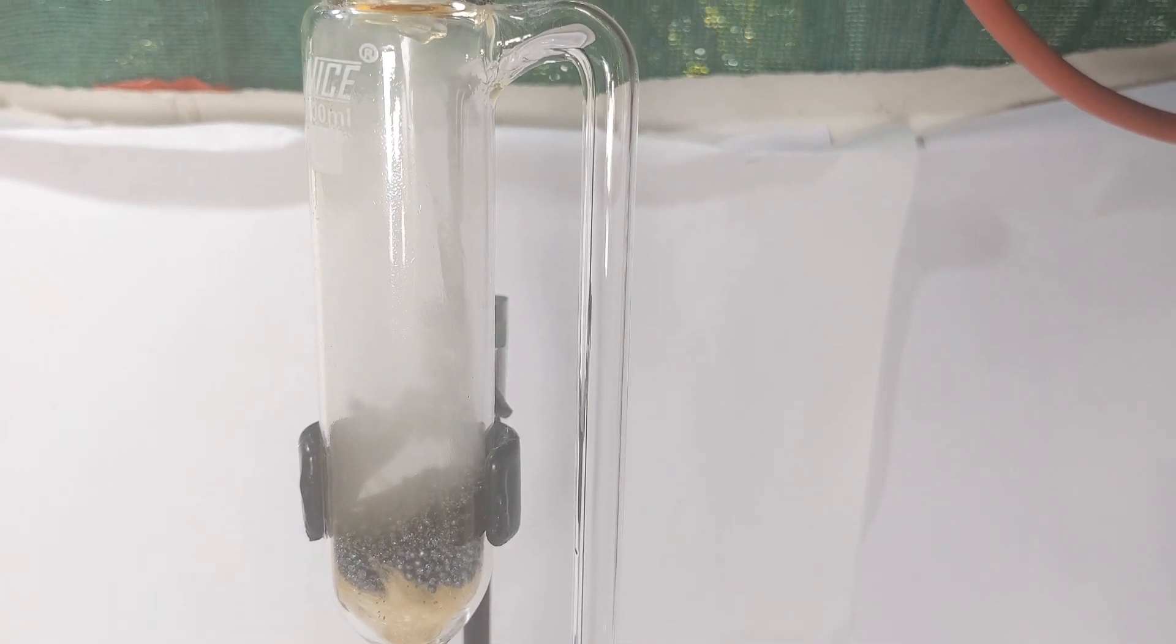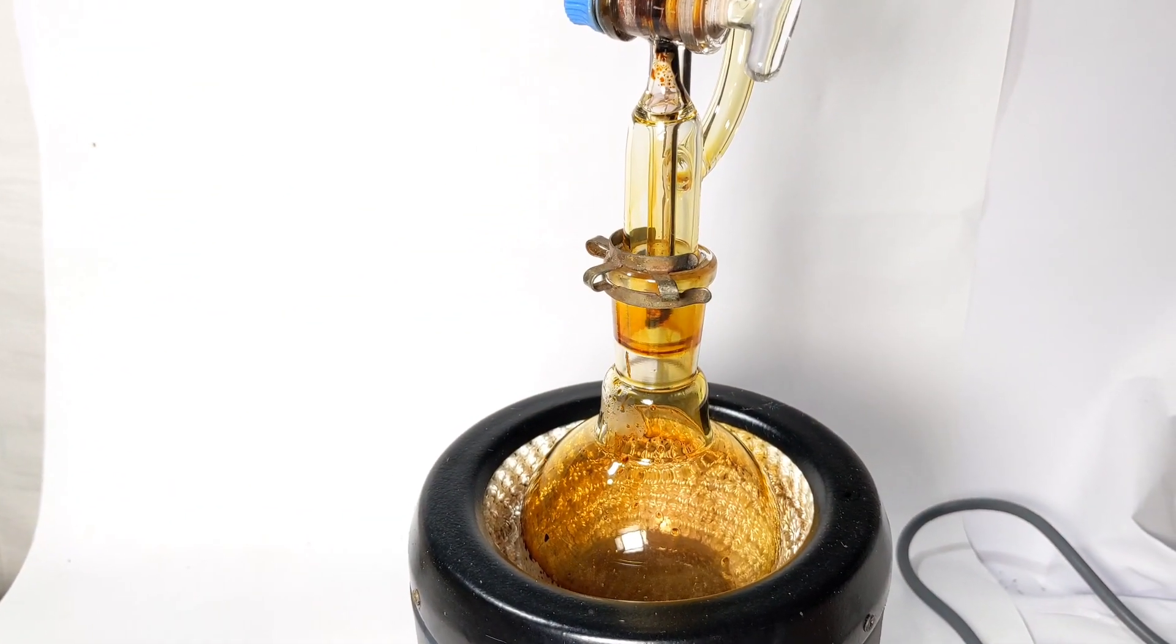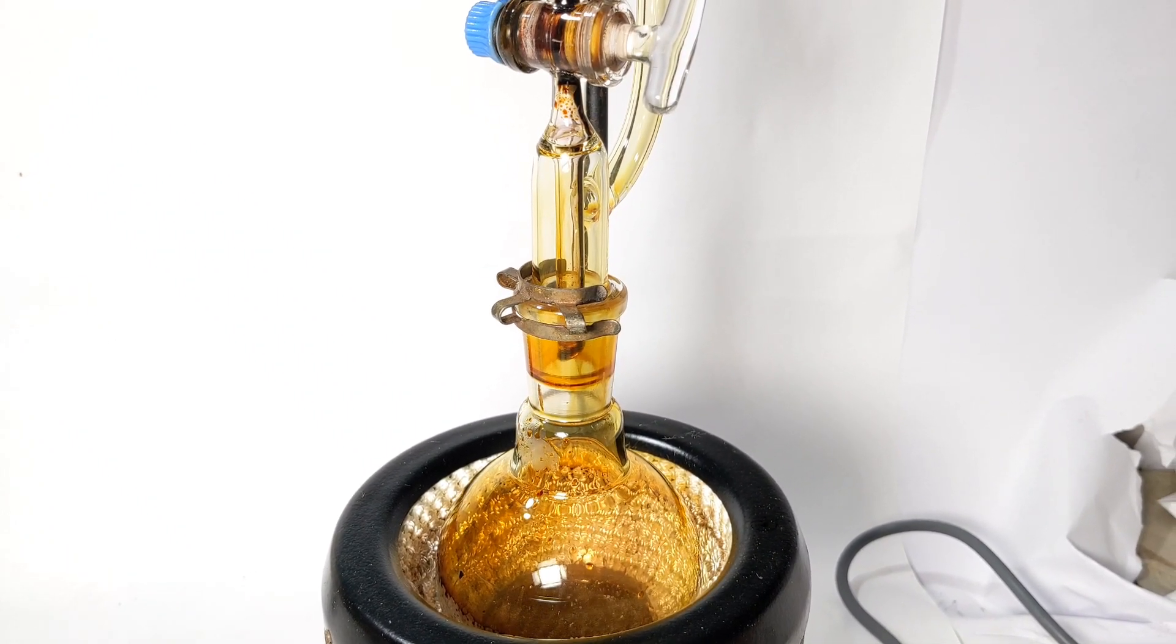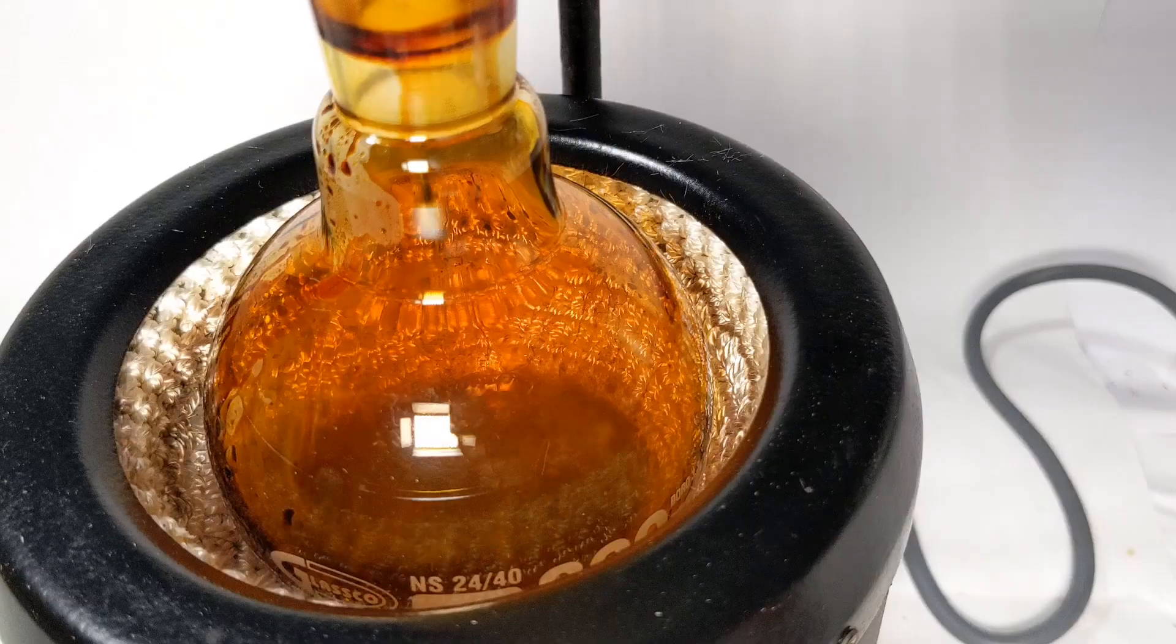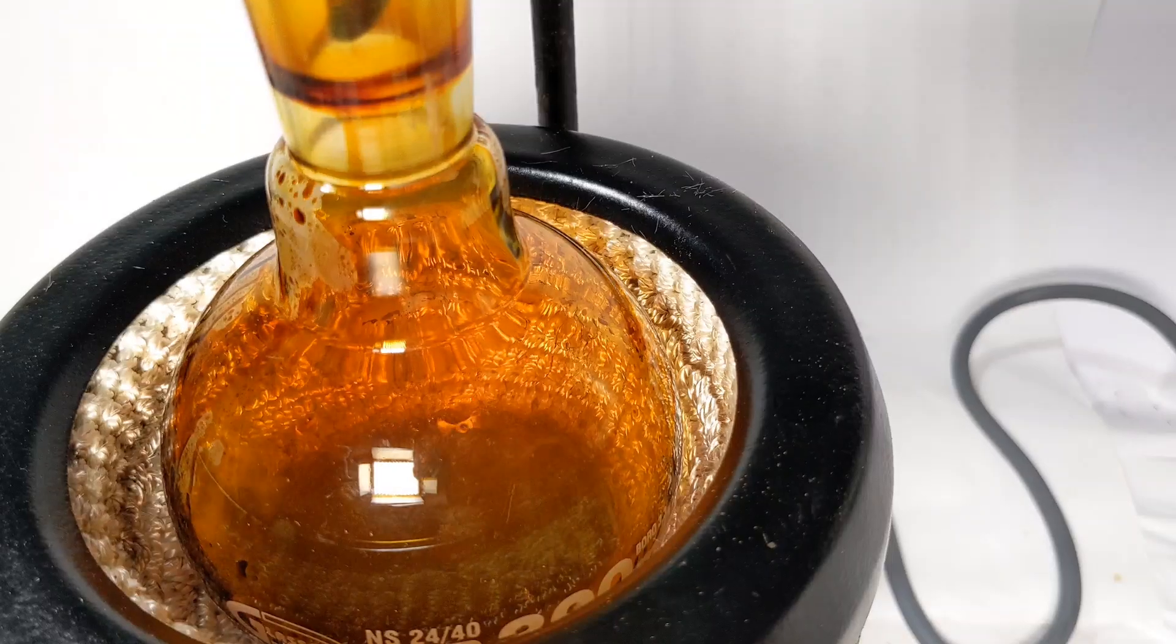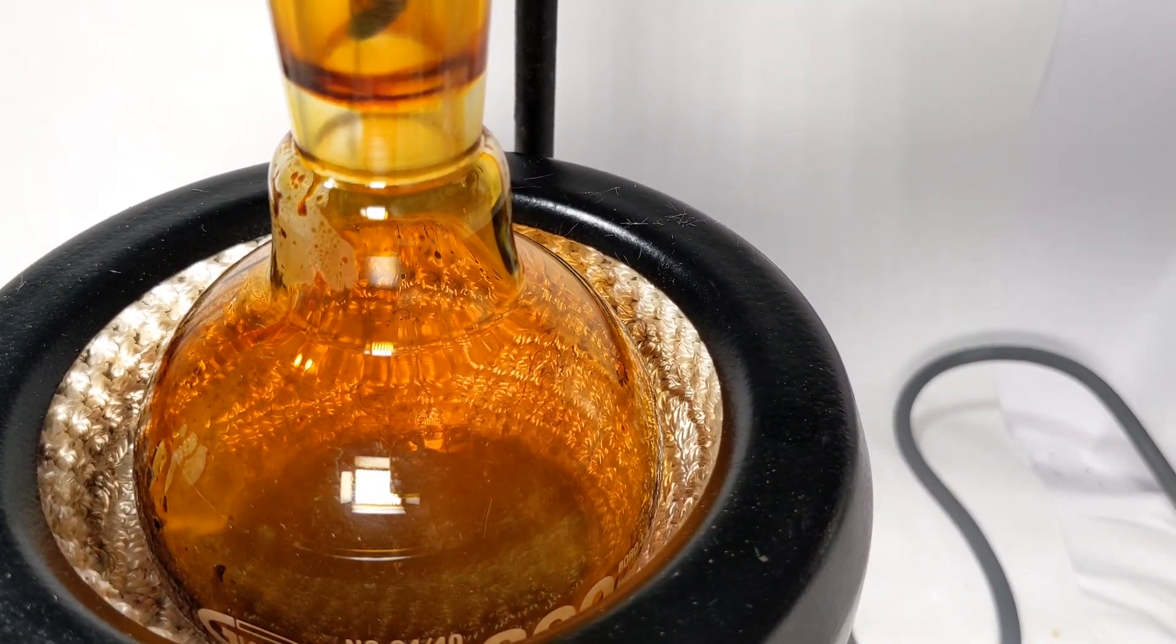When the iodine salts start to dissolve in the n-butanol, the knob of the funnel was opened and a steady drop of iodine in n-butanol was added to the red phosphorus. This causes an exothermic reaction and heat of the reaction is sufficient to cause the boiling of n-butanol into the funnel through the sidearm. Hence heating mantle was turned off.